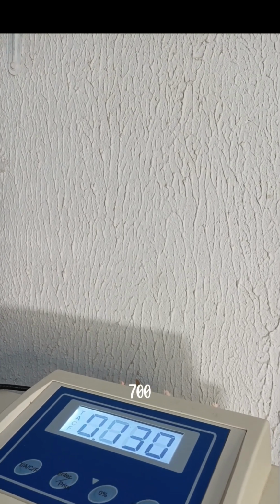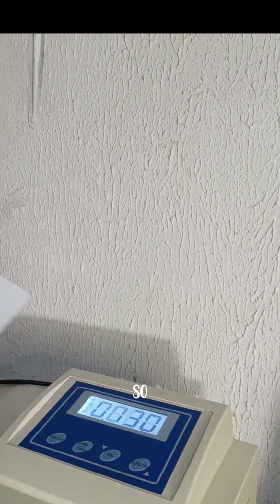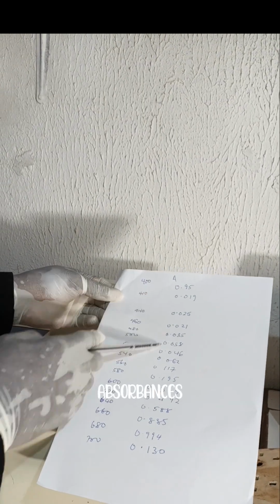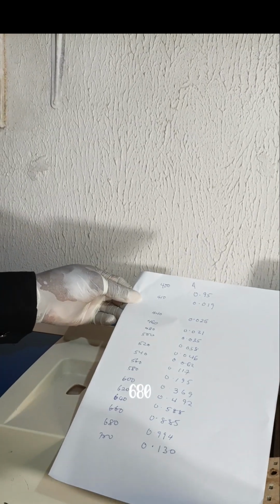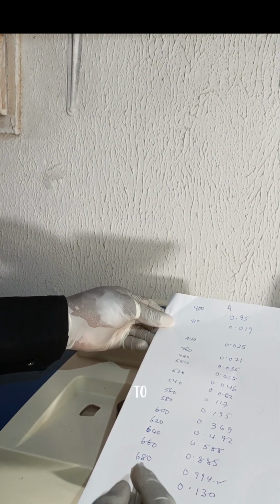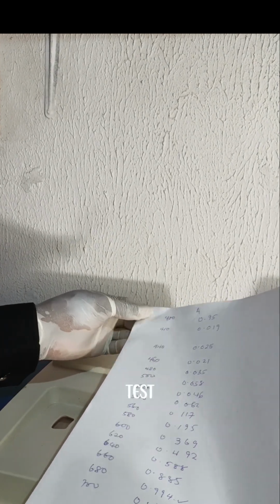So at 700, we can see it is now dropping back to 0.130. So from our examinations, you can see the different wavelengths and the absorbances that we got. From this, we can see that 680 nanometers gave the highest absorbance. So we will have to set our wavelength at 680 and perform the test.